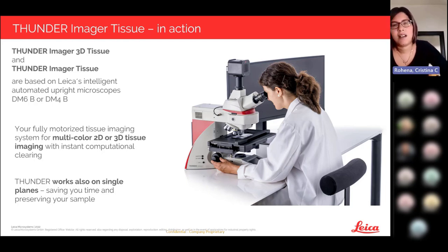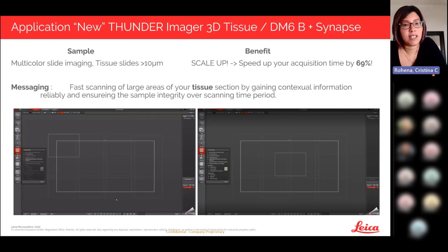As I mentioned before, the use of Thunder or ICC is able to be done on 2D images. So you don't have to acquire 3D Z stacks, thereby saving time and preserving your sample. What's really nice now is that we actually have a new and improved line of Thunder Imager tissue systems with our DM6B in combination with Synapse. What this means is that we are now able to trigger our peripherals in our upright systems, allowing you to speed up your acquisition by even more than 69%.